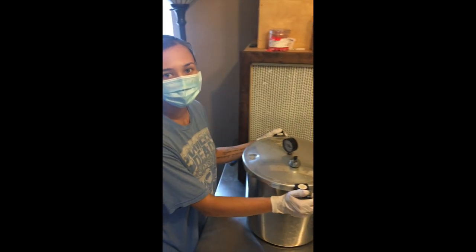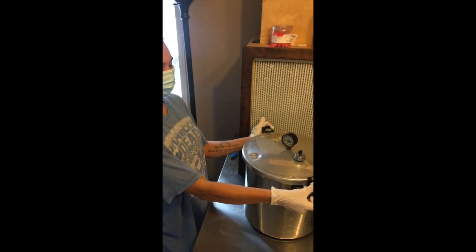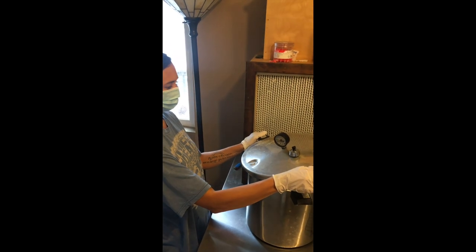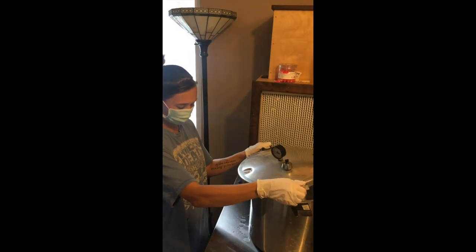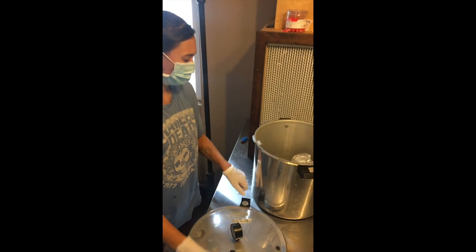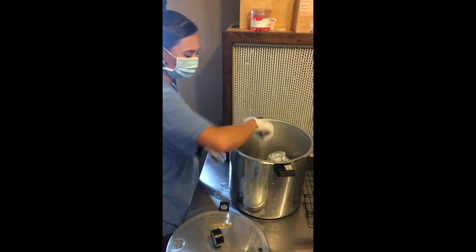I'm only gonna sterilize for 25 minutes. Our pressure cooker has depressurized now. I brought it in front of the flow hood — this is where we want to open it up. I'm gonna make sure to open it away from my face; there's a lot of really hot steam in there.